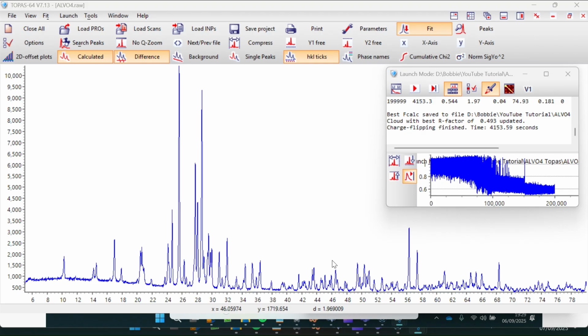So as a start, let's say this was your novel XRD pattern. The first thing that I would do is go to literature and see if I can find something that is similar, where the peaks might line up, not necessarily the intensities, but as long as it's got the right peaks, especially the most intense peaks at the right 2 theta, that's an indication that they're probably the same or very similar space group.